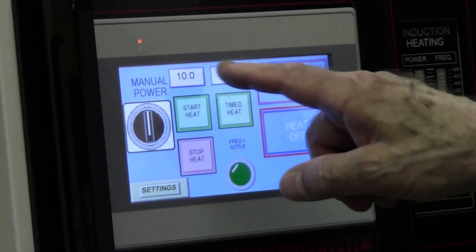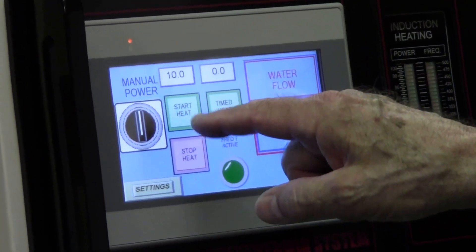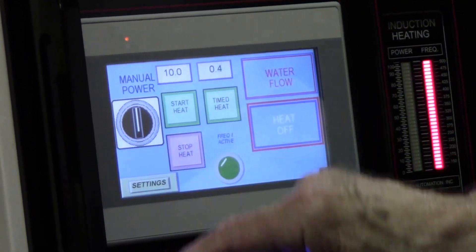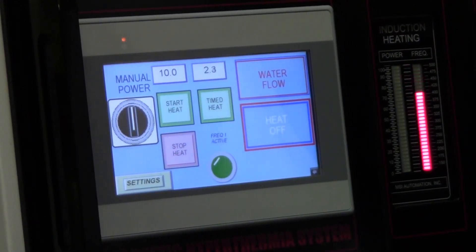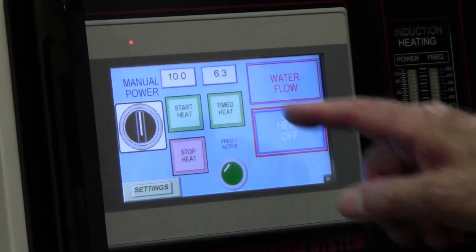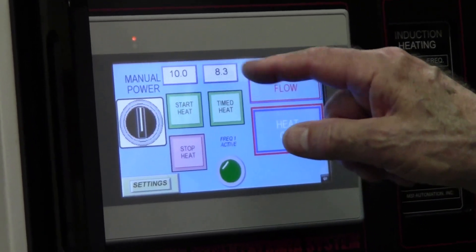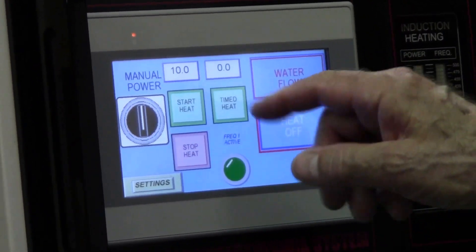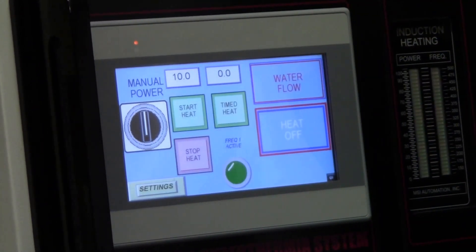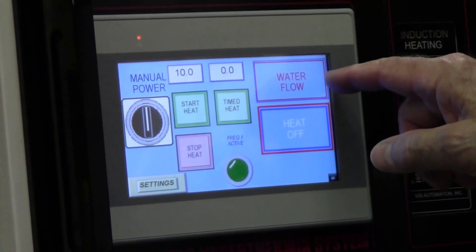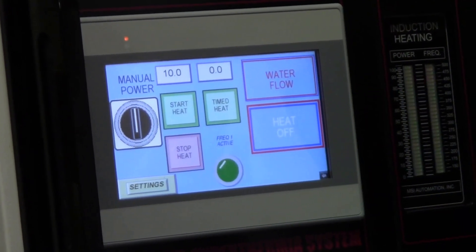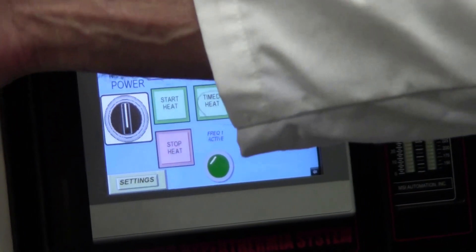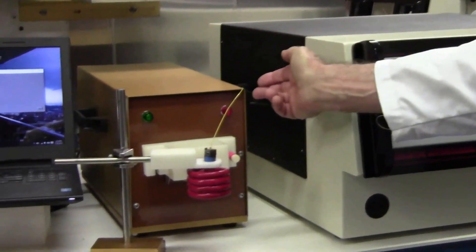And then if you want to use the timer, instead of pressing start heat, you would press timed heat. Right now we're not heating, we're just demonstrating. Six seconds, seven seconds, eight seconds, nine seconds, and now it's off. If you look in the right hand corner, it says water flow, which means we don't have water pressure.